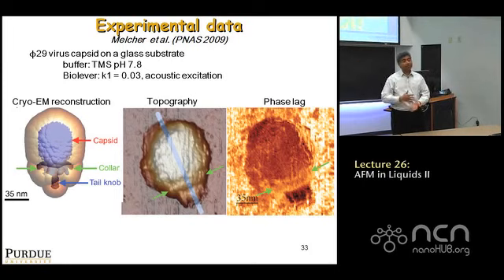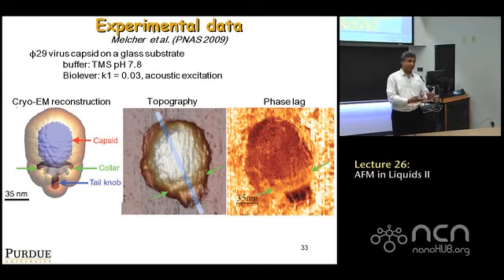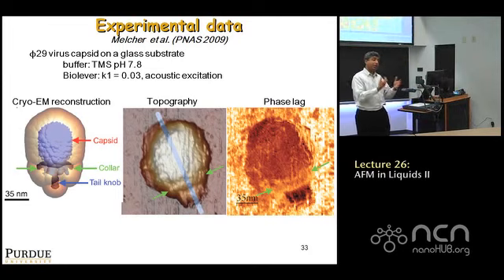So there are some good papers that have tried to prove that by controlling humidity and having samples that have regions of hydrophilicity or phobicity, you can tell from phase contrast which is which. Because on a hydrophilic region, you have a lot of liquid layer and therefore it is lossier, because the mechanism of losses there is mostly this making and breaking of meniscus.